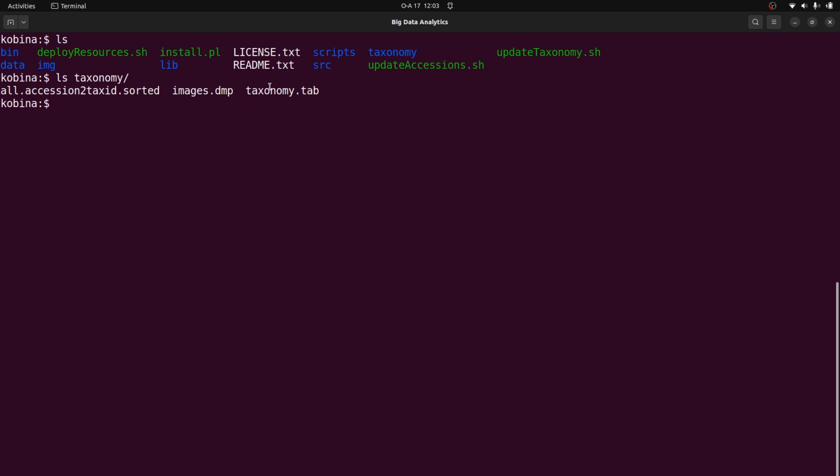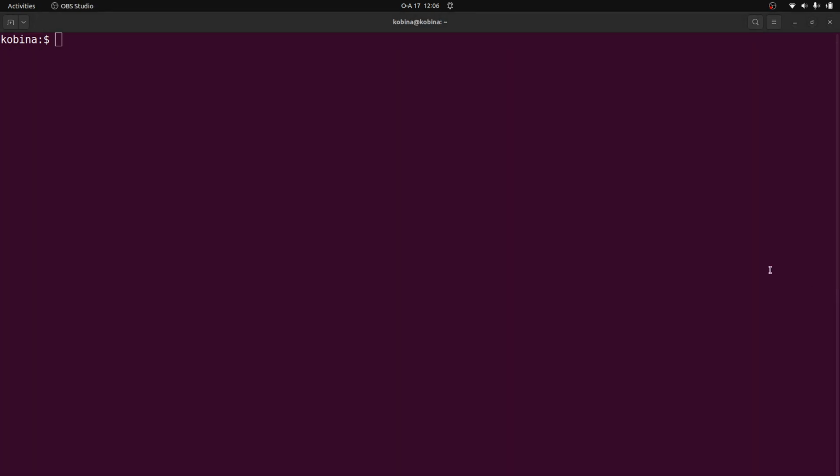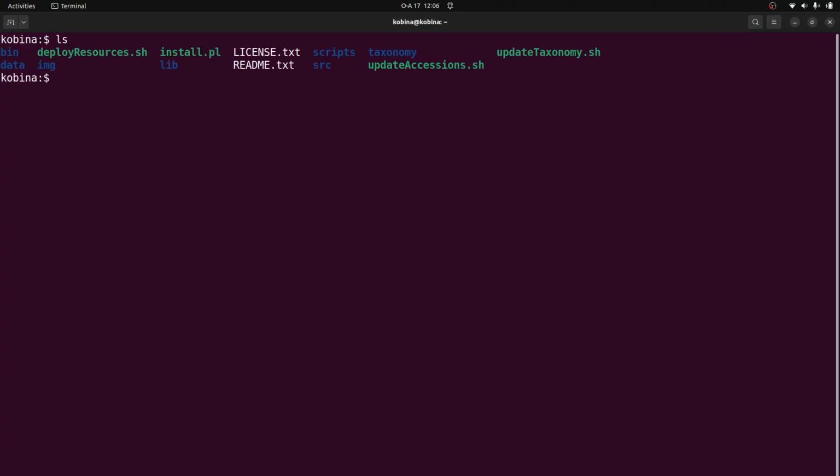All right, so this one, this. All right, so this. So if you see them, that's great. That means that everything is done. So now that everything is done, we still need to do some additional stuff so that we can always run KronaTools. All right, so let's clear the screen again. Let's ls. Perfect. And then let's proceed. Okay, so now let's do this. Now we have everything we need.